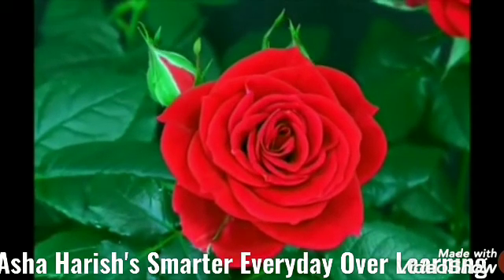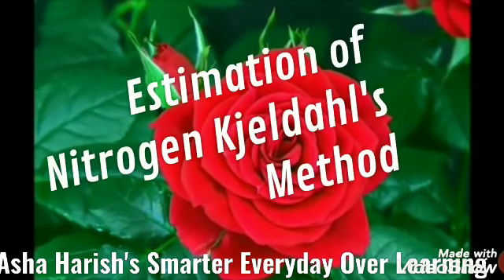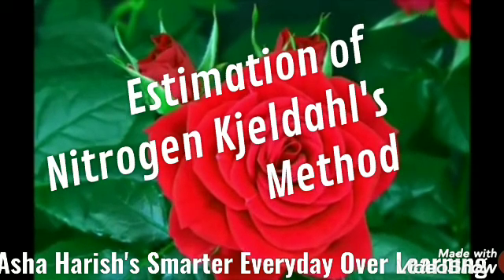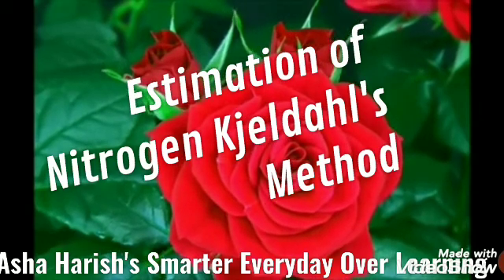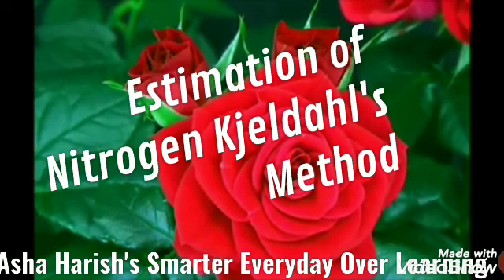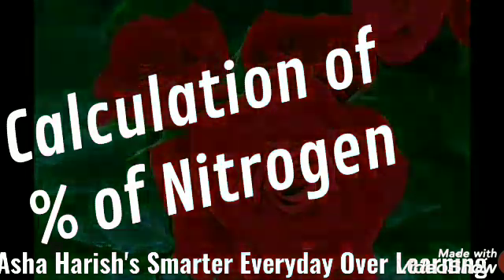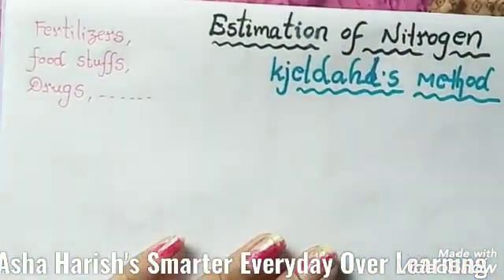Now students, in this session you are going to learn about the estimation of nitrogen by Kjeldahl's method. I am going to explain it with complete information on the apparatus for estimation of nitrogen by this Kjeldahl method. You also need to know the example here, and how we can calculate the total percentage of nitrogen in this estimation of nitrogen, Kjeldahl's method.